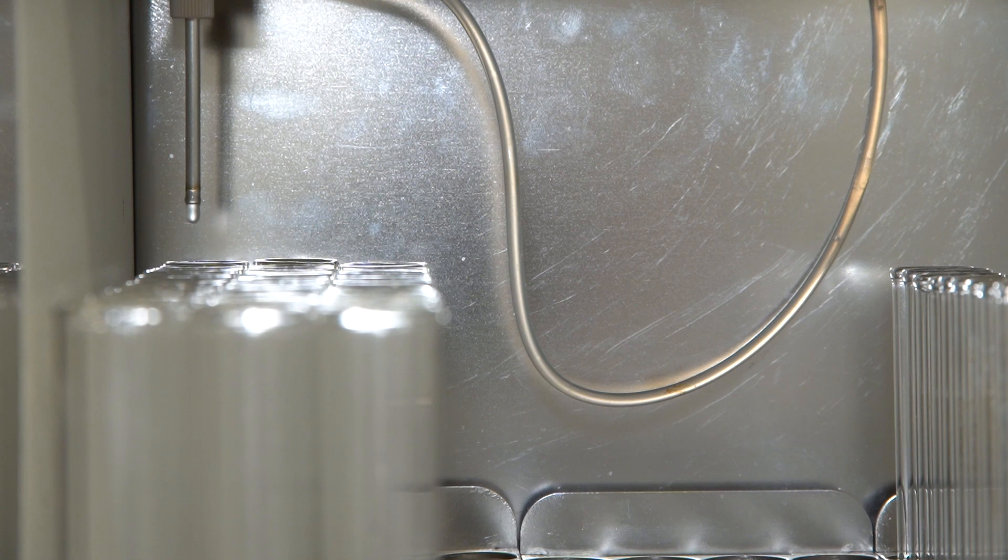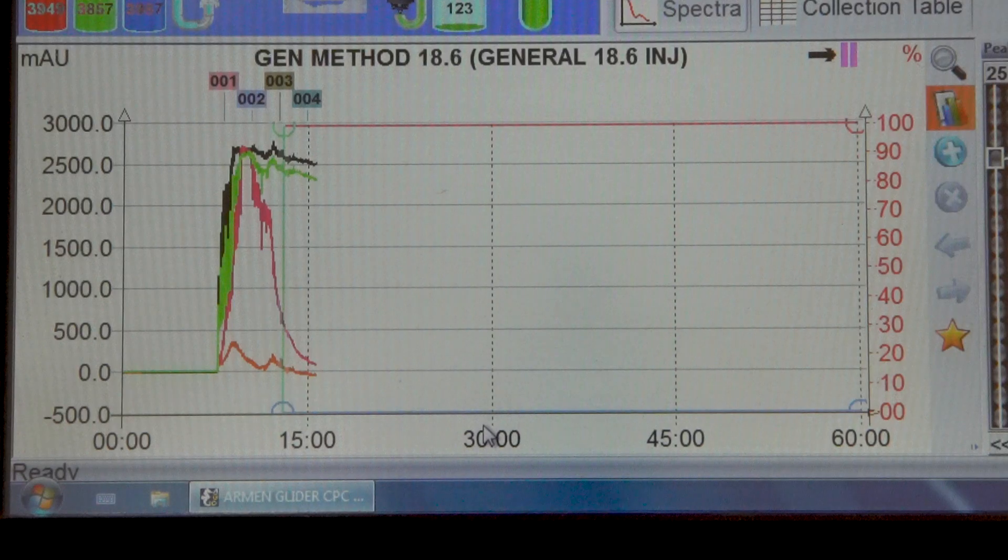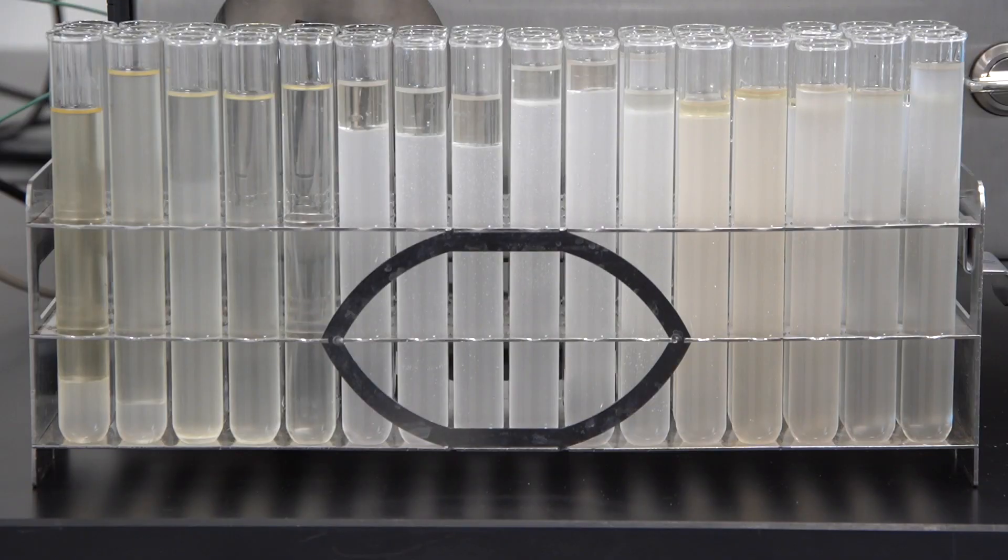The method that I'm going to be running today was designed specifically for THC remediation from CBD distillate. It is difficult to separate them because of the similarities. If you are looking to simply remove the THC, centrifugal partition chromatography is a great way to go about it.